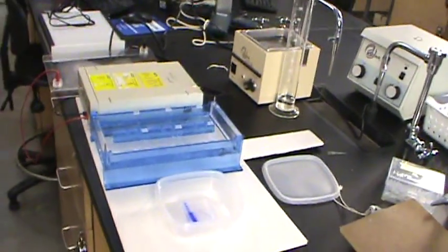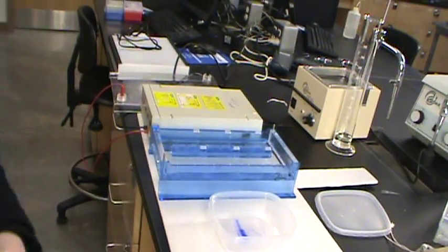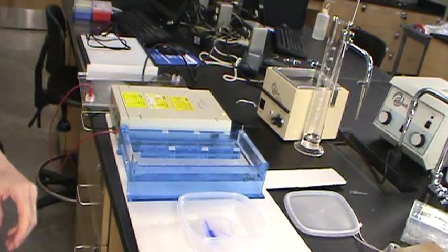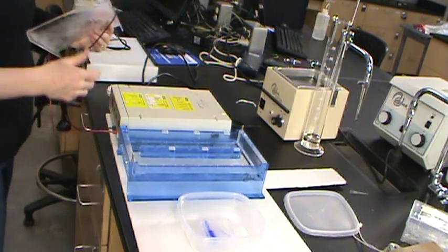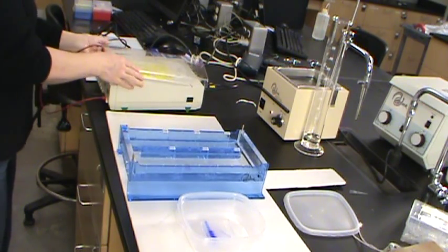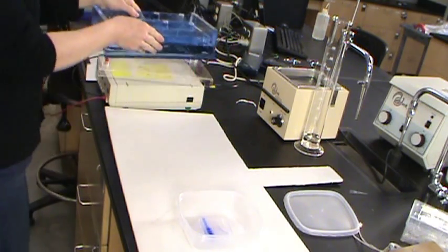Sometimes you can, most often in the research lab or whatever, we're going to use just a liquid stain in order to do this. But for our work here today, we're actually just going to use a very simple system that involves the use of what's called a card.